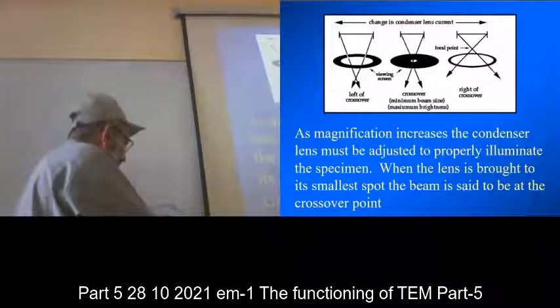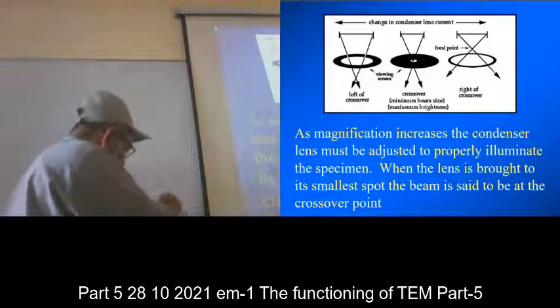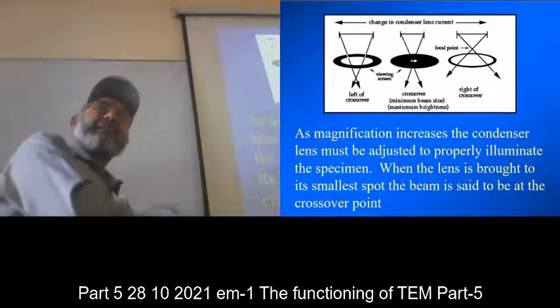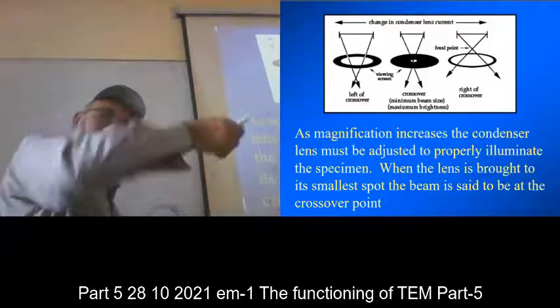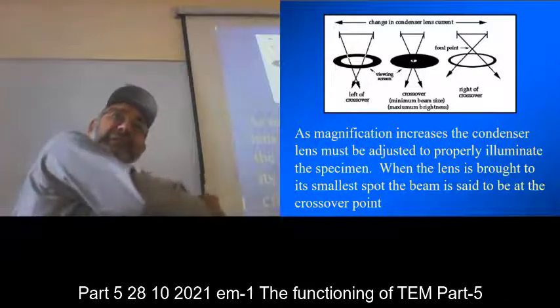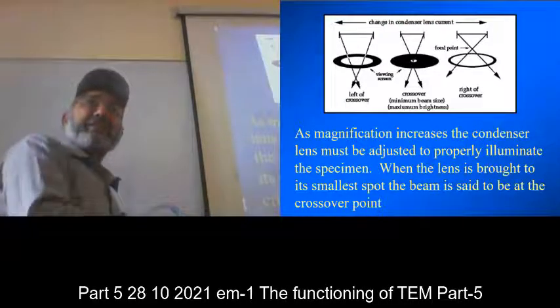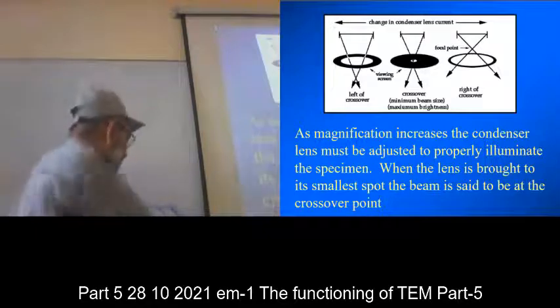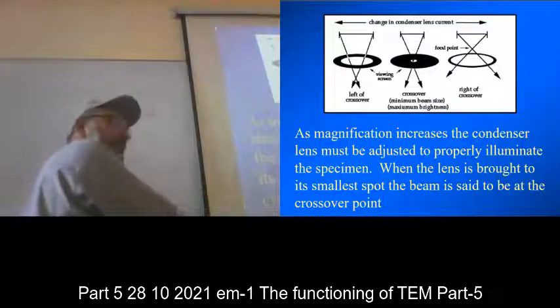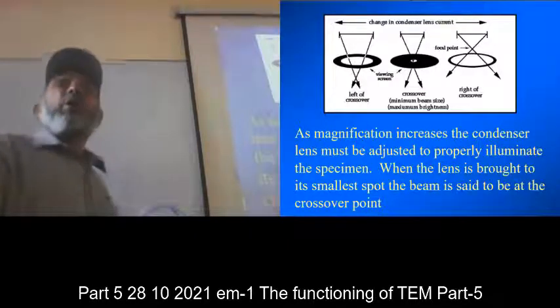It is spherical here and completely spherical here when you reach the edges of the screen. Then this is focus. That you increase or decrease the size of the spot and it doesn't move to the sides. This means the condenser lens is focused. If it moves, then it is defocused. But you never use the machine at this spot because it burns the screen. You spread the beam to the whole screen.